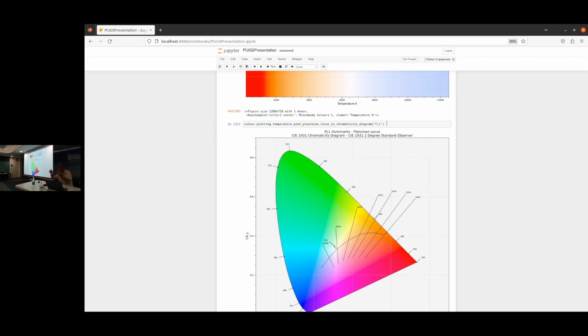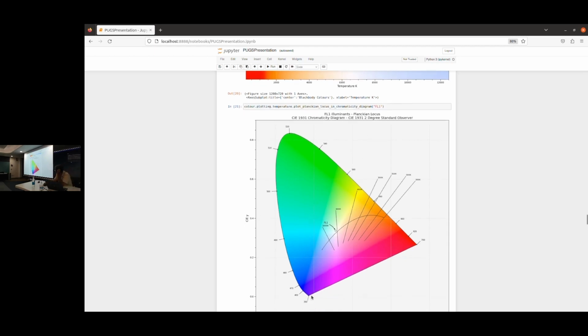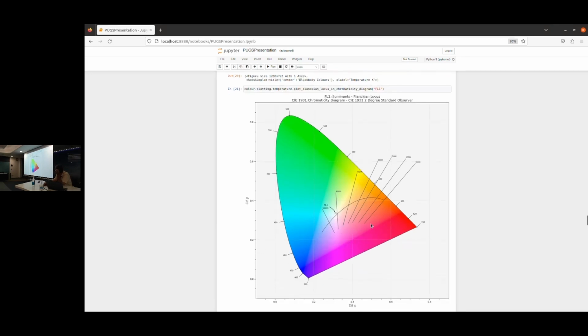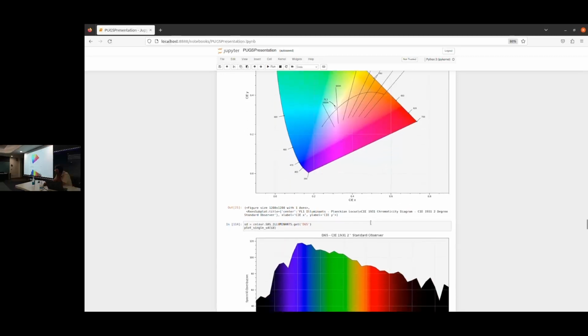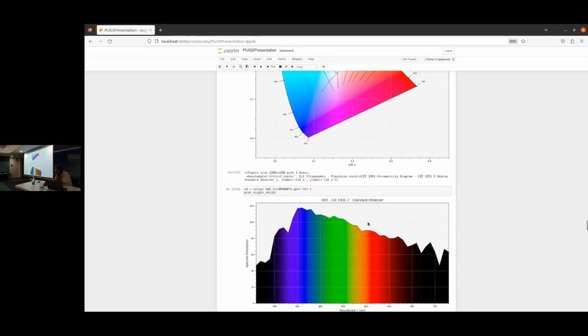These are spectra, data sets available in the color science package that have been recorded or made available and stored there for you to play with. So fluorescent lamp FL1 is somewhere over here, and I think that's just one of the characteristics that is specified when you manufacture these things. So I think that's my last illustration on this topic.